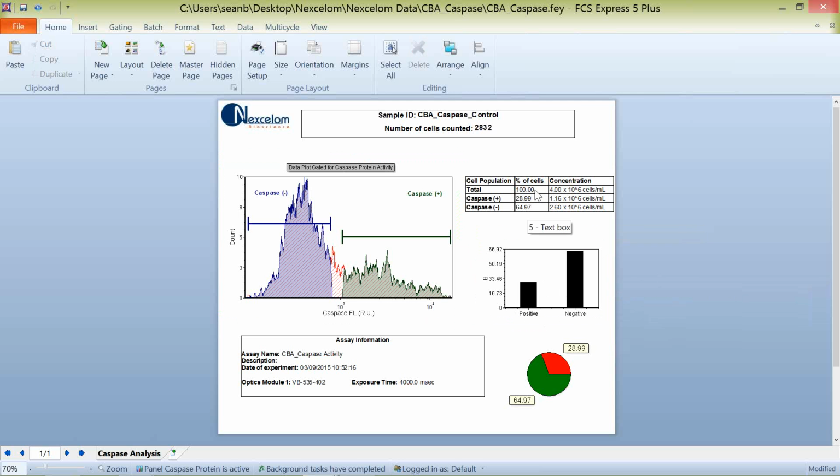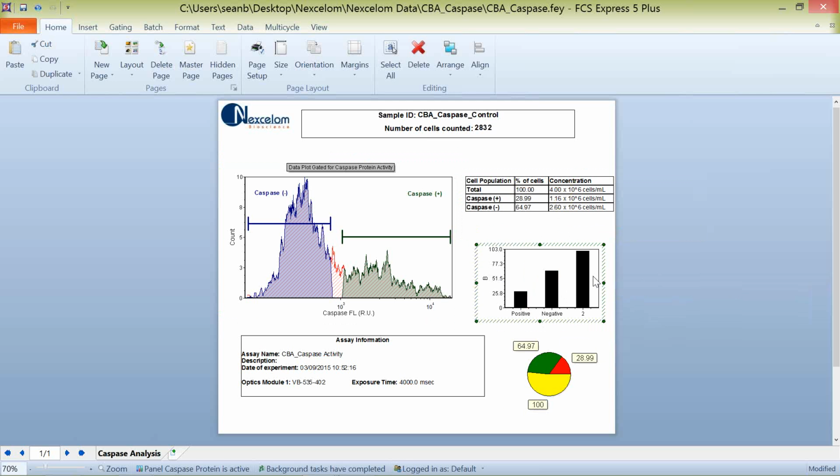With bar plots, we've made it very easy to actually insert statistics now. If I wanted to grab this total population and add it to the bar chart, I can just drag it and drop it, and you can see that bar is added there. I dragged it underneath so it adds it as a new series, and if I dragged it right onto the bar chart here, it's going to add it directly in there. Again, all these are going to update in real time for us.